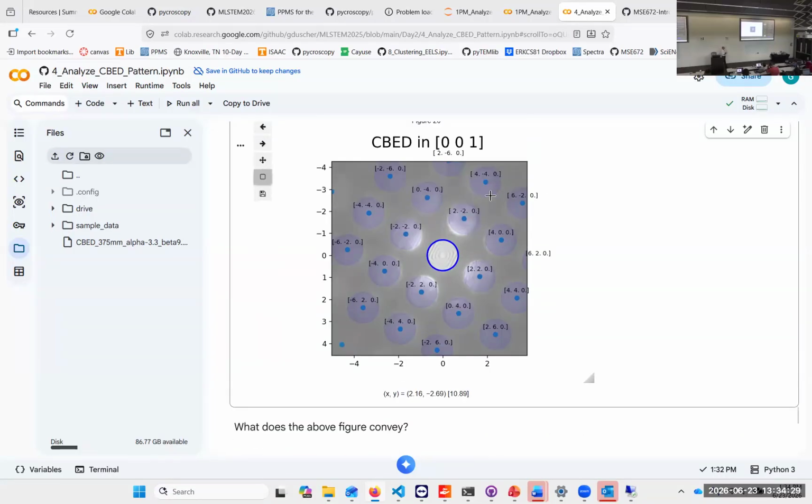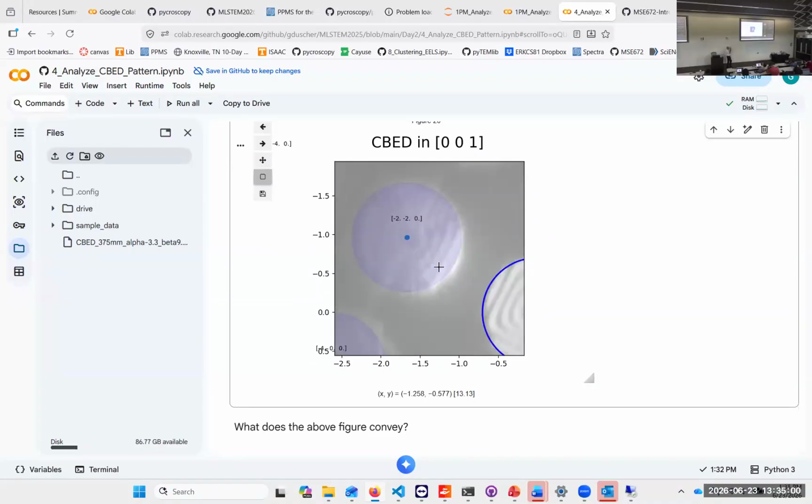It's very difficult for normal methods to find these kind of circles. And the reason is relatively clear. So they have a lot of different structures in there. One way of analyzing these kind of structures is, of course, making them rotational invariant, because they all rotate around, and try to match them. The other one is to try to match them with simulation.